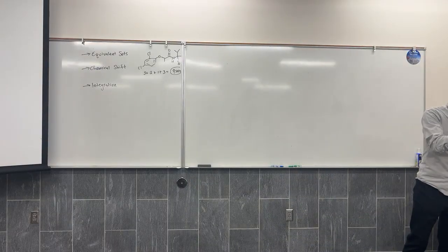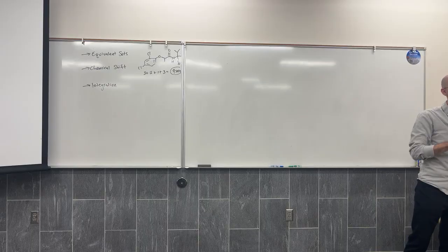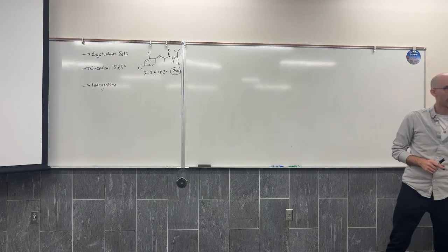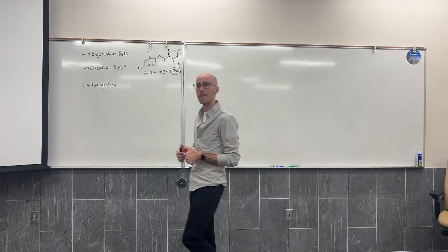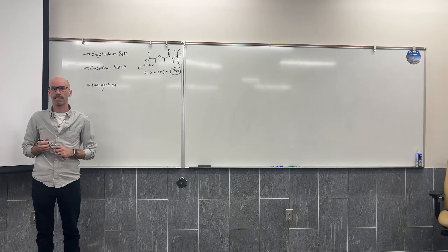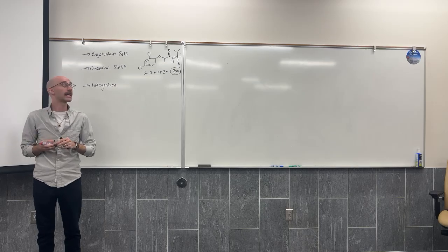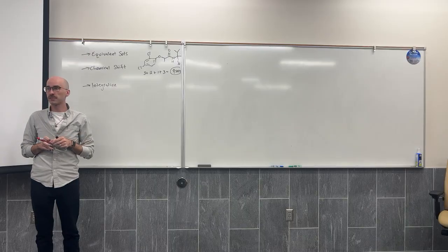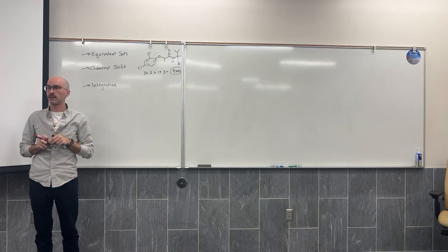So what do you expect would be furthest to the right, and can we narrow it down as much as possible? What would be the furthest right? Talking about that group that's on the board. Yeah, for this molecule. Which signals would we expect to show up furthest to the right? Would be the two equivalent methyls.